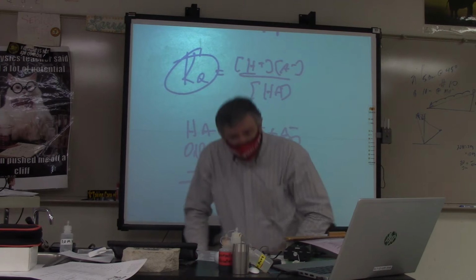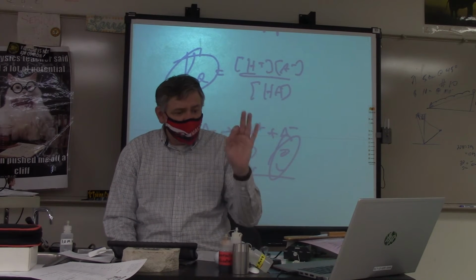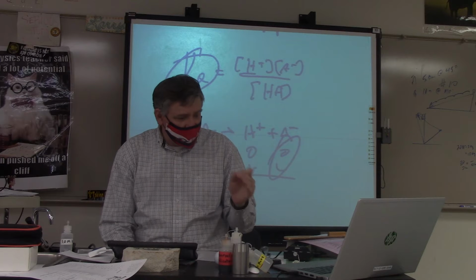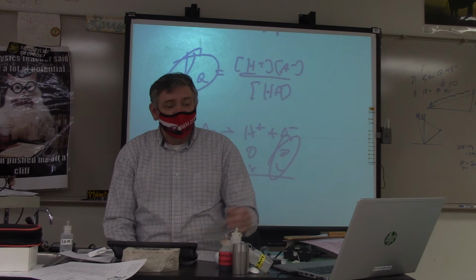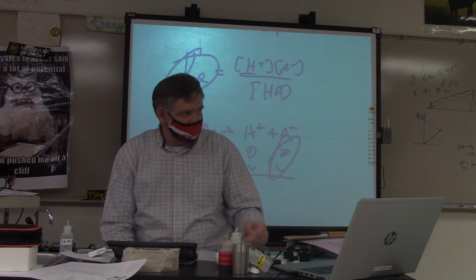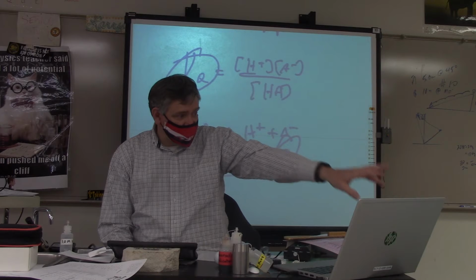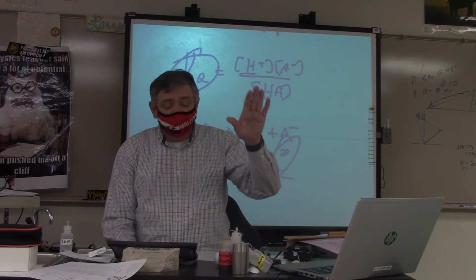Now, what you all need to do for the third titration is figure out what mass of sodium acetate you need to add to 25 milliliters of a 0.1 molar solution of acetic acid so that you can start with a pH of 6, okay? So that's that third calculation down there on the bottom of the front page.